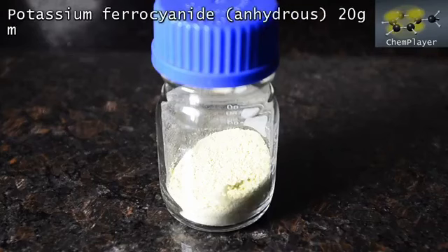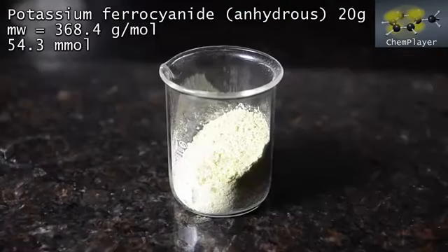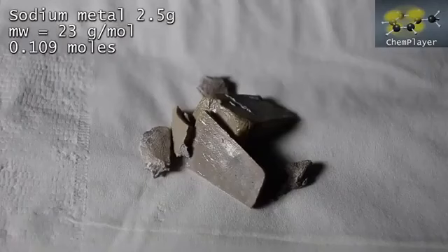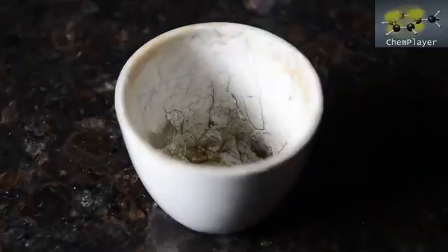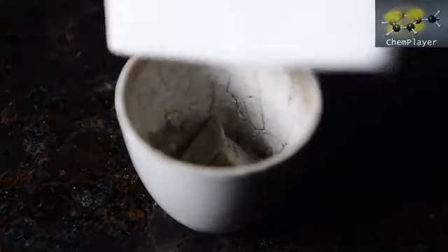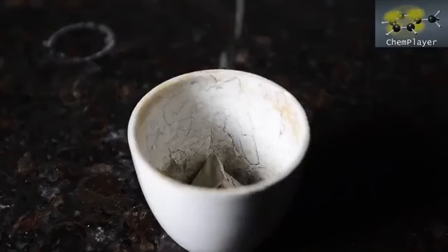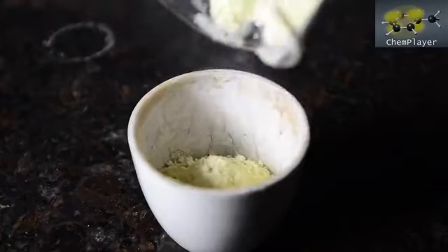We'll run through very quickly because you've seen this in a previous video. 20 grams of oven-baked anhydrous potassium ferrocyanide powder. 2.5 grams of sodium metal, cut up into small chunks. Sodium goes into the crucible. We actually recommend you use a metal pot instead for more efficient heating. Ferrocyanide powder on top of the sodium.